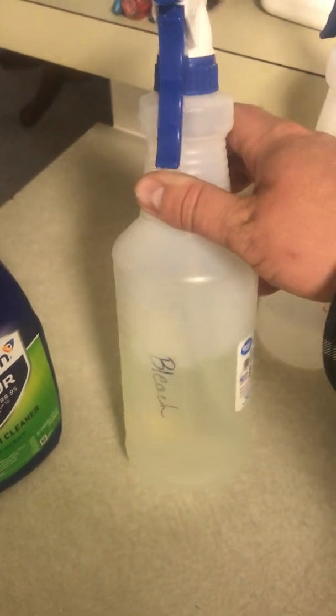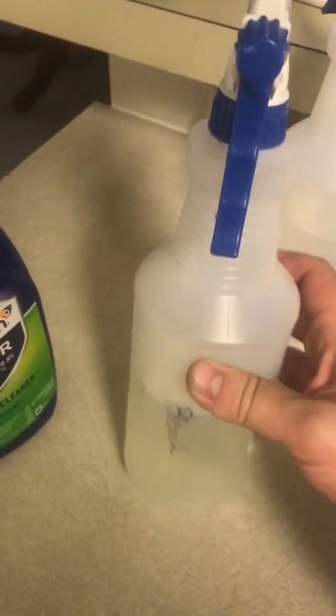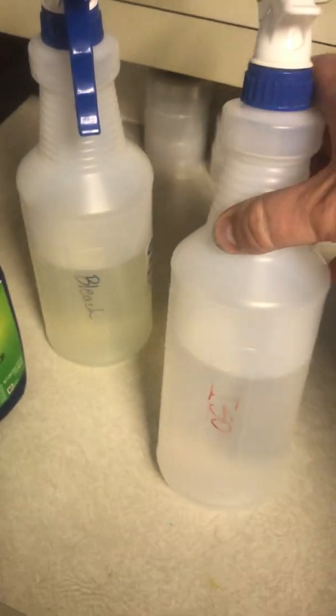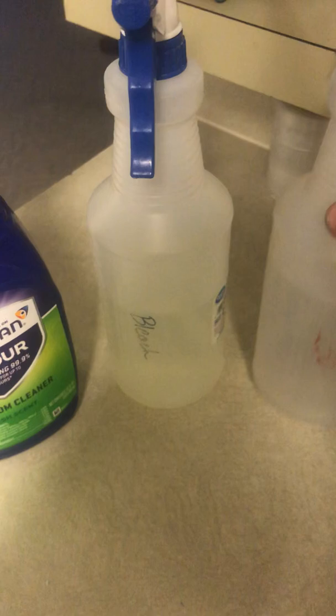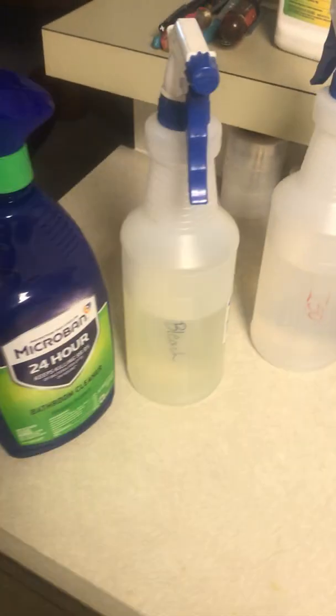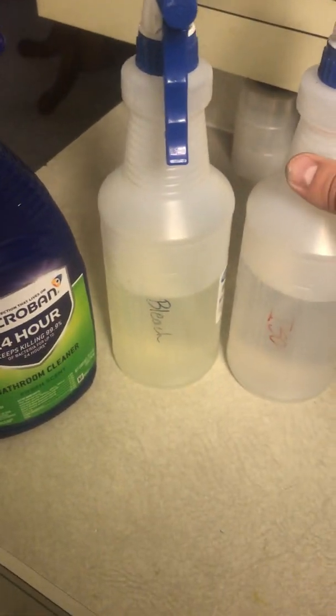These $1 spray bottles from Walmart are pretty good for holding common cleaning stuff like bleach. The most common cleaner I use is isopropyl alcohol, but last year with COVID we were kind of at a shortage, so I used a lot more bleach. The most important thing to remember, especially if you're working inside a still air box, is try not to get your bleach and your alcohol mixed together, because you'll get some nasty gas.